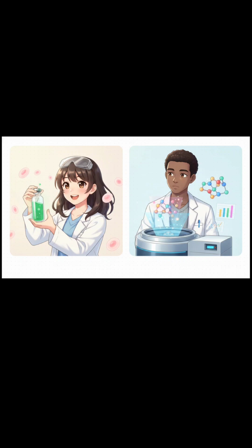On the right, we have analytical centrifugation. Here, you're not trying to isolate a product. Instead, you're strictly collecting information to characterize those already purified biomolecules in real time. You're measuring things like their molecular weight, their purity, or even detecting changes in a protein's structure as it spins.